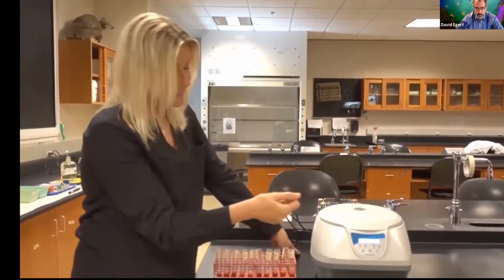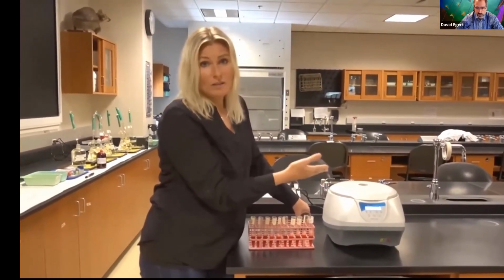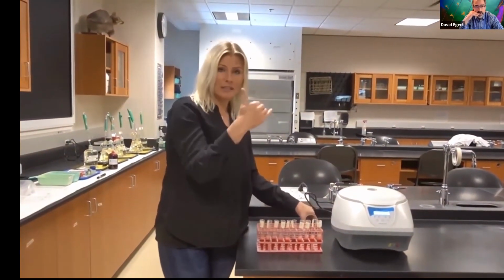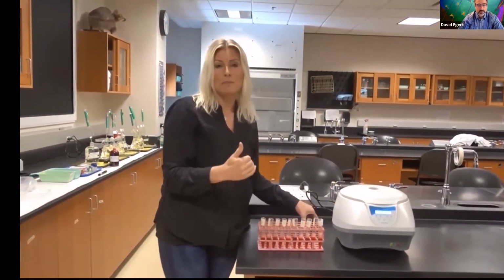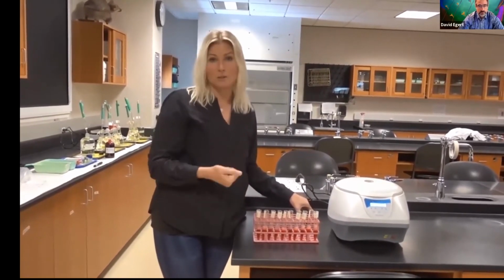That's quite amazing. So we're going to get a lot of G's, and it's going to separate out the components of this fluid based on density. We're going to get the denser particles at the bottom, so our red blood cells will be down there forming a pellet, hopefully.